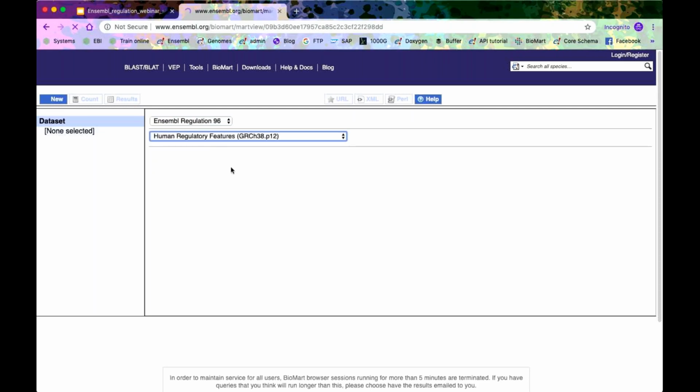The query I'm about to do is massive and stupid, and BioMart probably wouldn't be too chuffed with me for doing it, but I'm going to do it anyway because otherwise it involves me coming up with arbitrary numbers. Oh, come on, load for me. If it doesn't load in the next minute, I will just carry on and pretend this never happened.